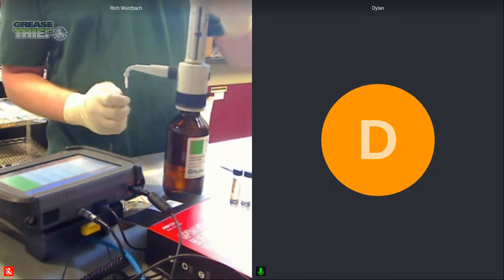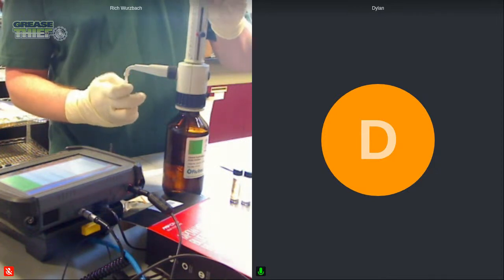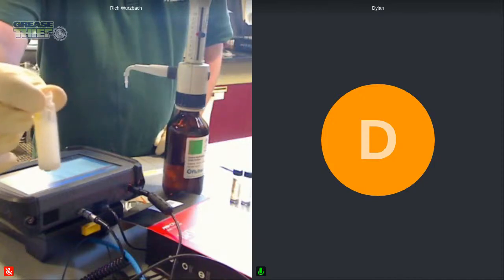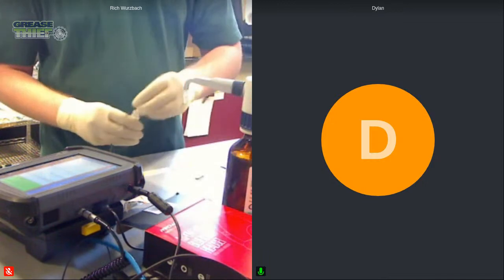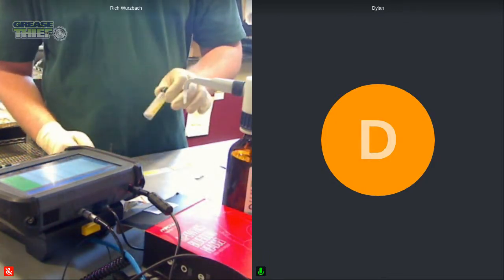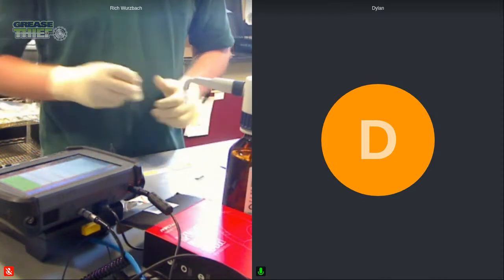So we have a nice dispenser here, so we know we're getting exactly 5 milliliters of solution every time. So we see that puts 5 milliliters of solution into our vial. And this is where we would begin the process of the sample sitting for 6 hours. So we're not going to keep it open for 6 hours before we run this.